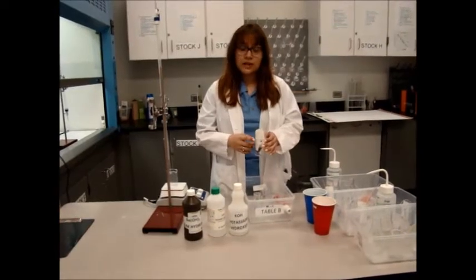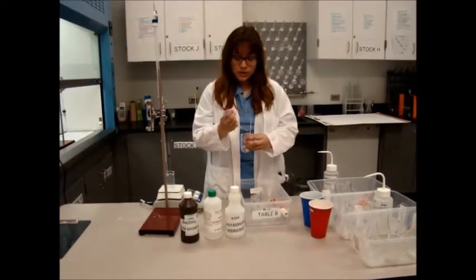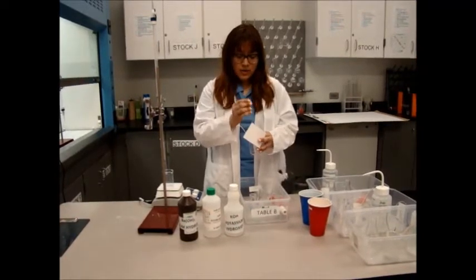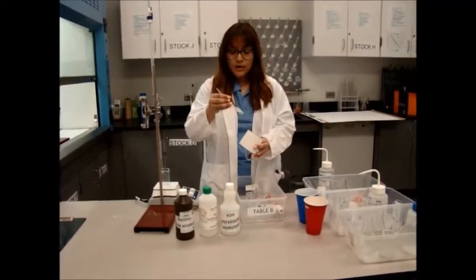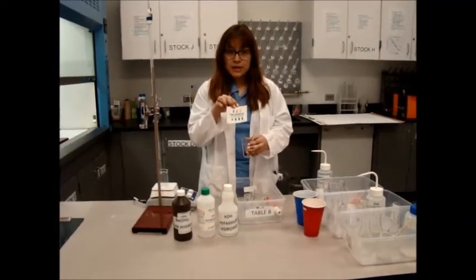Alongside you will also have indicators. You will have one pipette of universal indicator, which is going to be this one. And then you will also have a pipette of phenolphthalein. The other thing you will have is the Flynn pH scale chart.